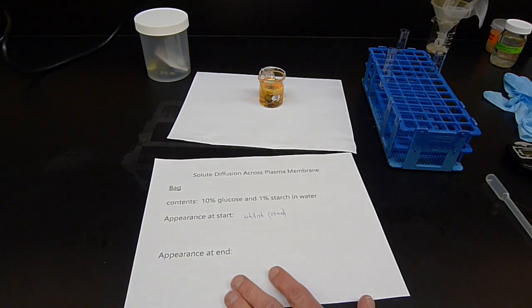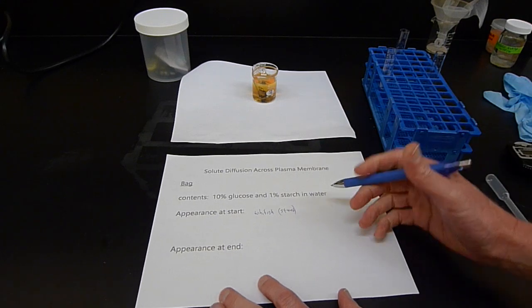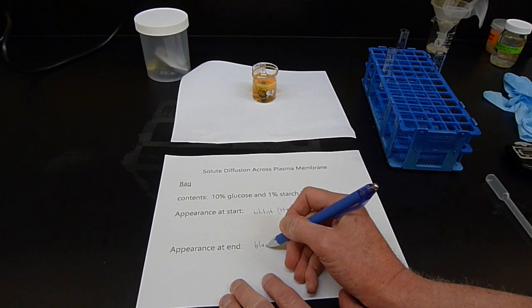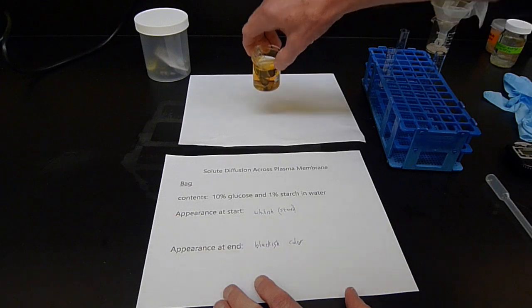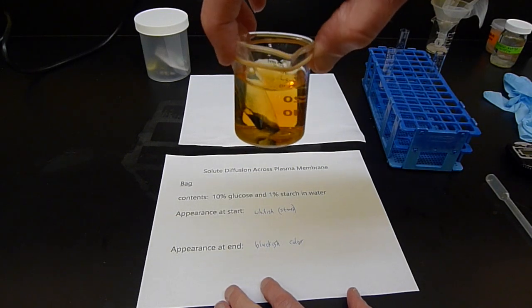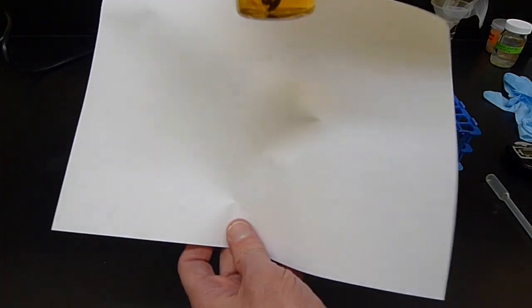So on the bag, at the end of this incubation period, when things have diffused a bit, we see that it has a blackish color in it. It's not uniformly black, but obviously that's the thing that's really changed here, that there's a significant black color in the bottom of the bag.